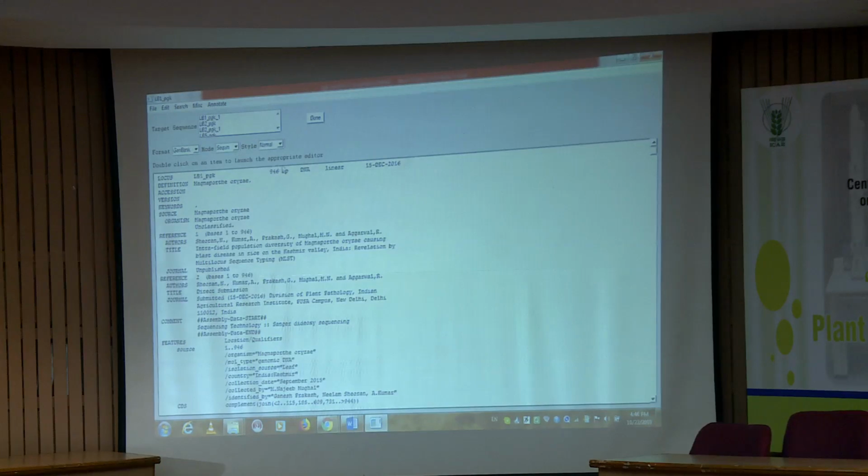Now, it will highlight how many bases are ready with you for submission. This is the date, this is the organism name, these are the authors, this is the title of the study. Then how many bases it will recognize itself, then what technology you used, it was Sanger's technology.